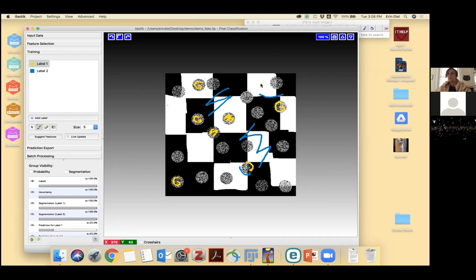So for example, this gray value being 255, this gray value being 0. So taking into account the neighborhood, for example, the surrounding information of a pixel here versus a pixel here versus a pixel here, and we'll see how you might do that. Then you take all of that information, the information about that native pixel and the information of its neighborhood, and you use that to learn some rules about why these pixels are different from these pixels over here, and that allows the algorithm to separate them.